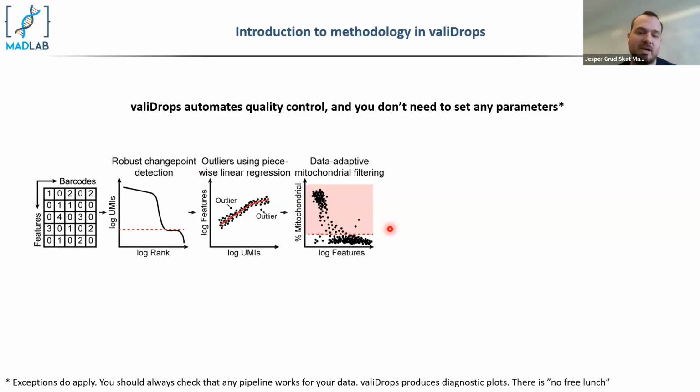For example, humans and mice are different, but also very metabolically active tissues, for example, brown adipose tissues, could be very different, or heart cells could also be very different than more metabolically inactive cells.